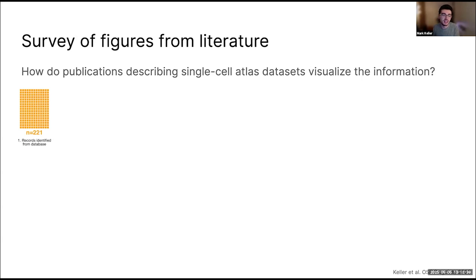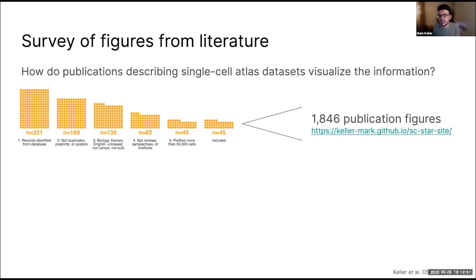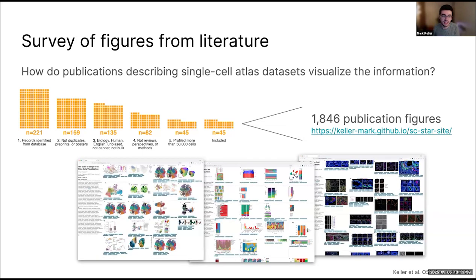We did a literature search and identified 221 papers, filtered these down based on some inclusion criteria, and analyzed over 1,800 figures within these single cell atlas publications.